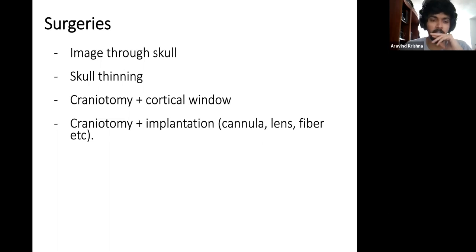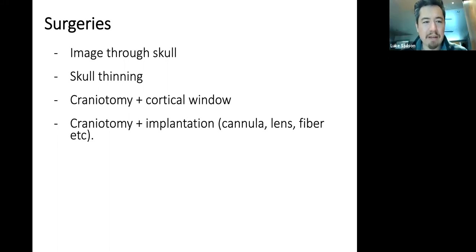If you oversample the indicator at any instant, say 5 or 10 milliseconds is the convolution window size of the GCaMP indicator, then you want at least greater than that resolution. Right, but it's much longer than that. Okay.